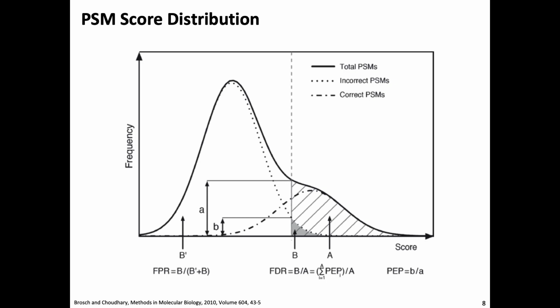If you want as many identifications as possible because you're trying to form a hypothesis, then it might be totally fine to have 10% falsely identified peptides, because you probably are going to do some downstream validation anyhow, and then 10% incorrect identifications is much better than missing an interesting candidate that has biological meaning.